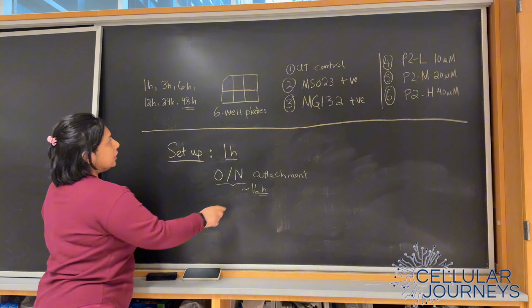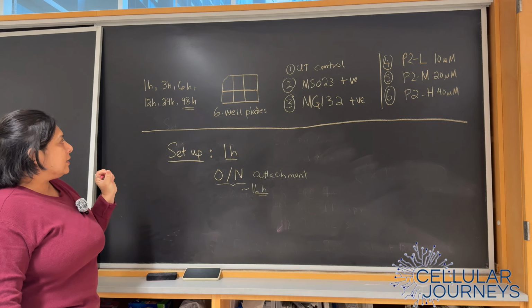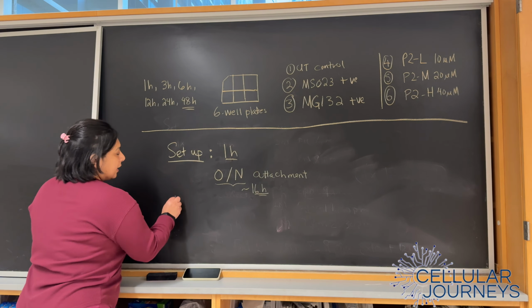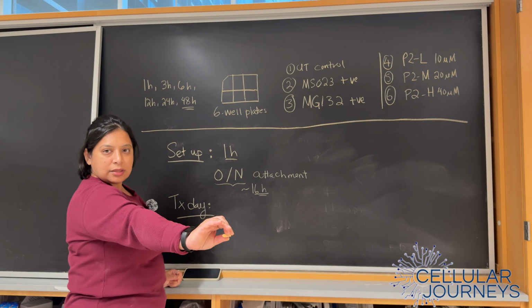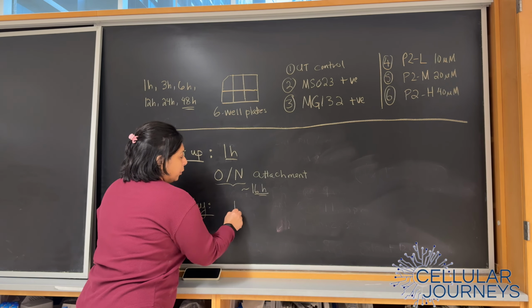Then once we start, there are 2 different ways that we could do these time points. The first way is that I start my treatments at the same time. So on the treatment day, in that case, I'm going to take all my cells and start them all with the treatment. So I will remove the media.